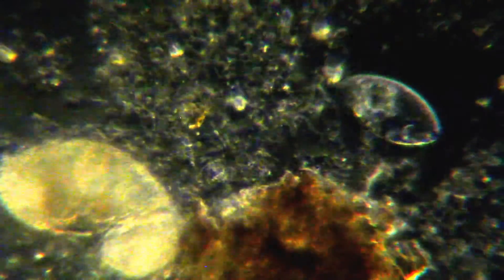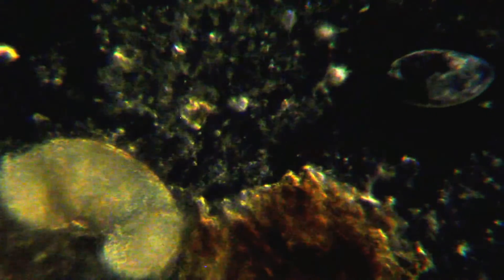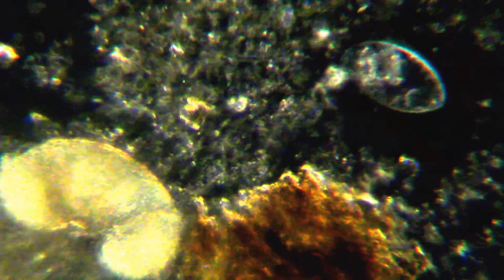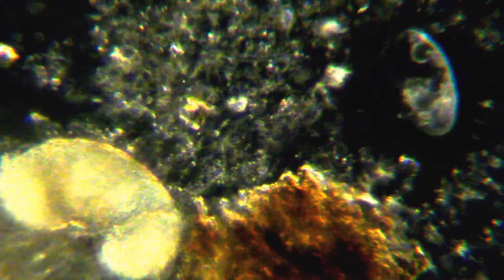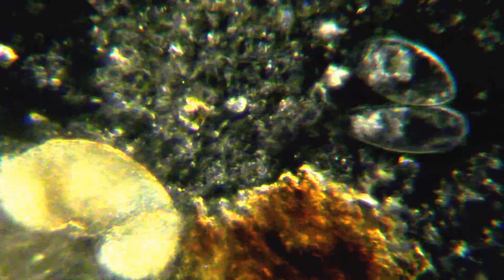Just being able to rotate things here a little bit gives you a slightly different perspective on the Darkfield. Right now I'm using the regular 25 power lens. Now I'll switch over to the Phase.